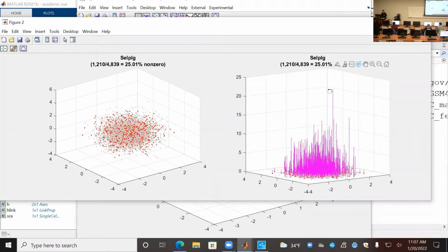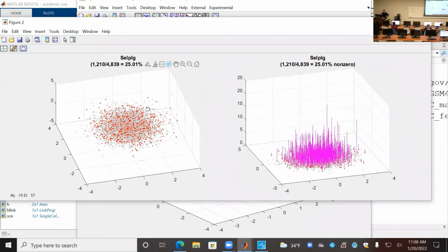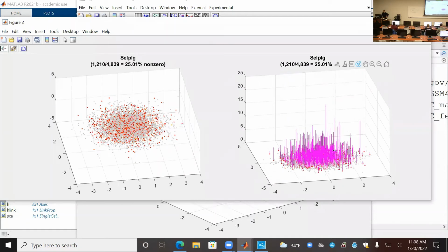And that expression level is measured by, remember what? The number of UMIs. We mentioned the UMIs. It's not the amplified number of copies, it's unique copies. In this case, you can also rotate the picture to give you a better angle to see these stem plots.